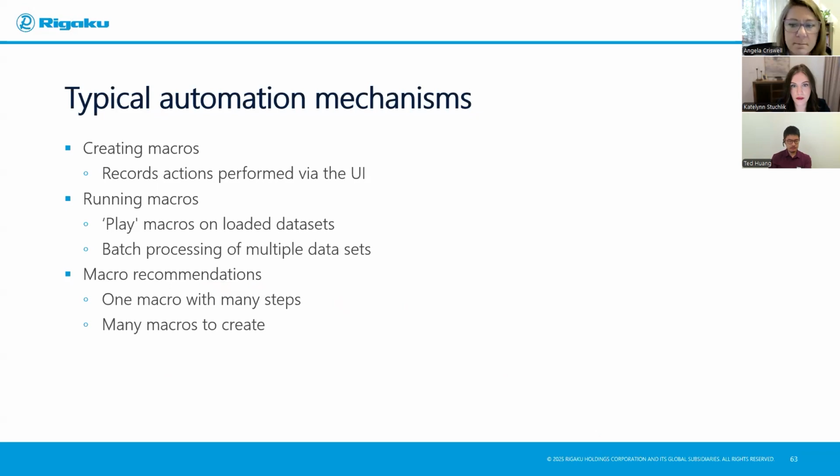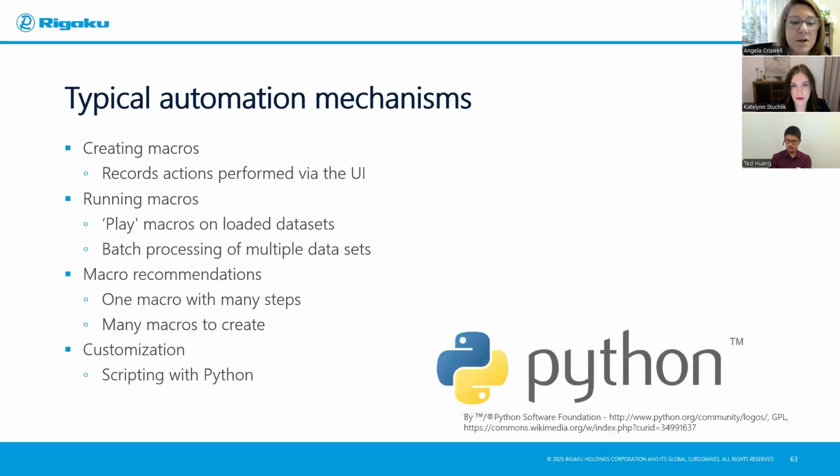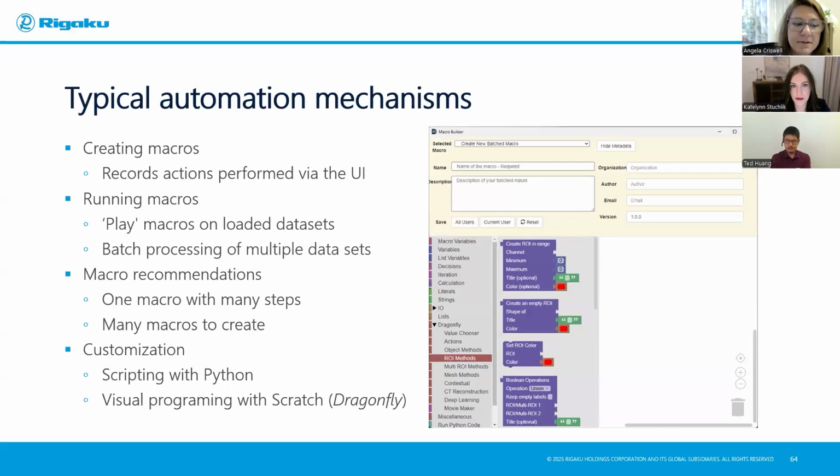And of course, there's always a mechanism to customize these. So if you already know programming with Python, then you're in great shape because these use an underlying Python programming language to do this. And additionally, specific for Dragonfly, they do have some visual programming using Scratch. So if you're familiar with that program that was developed by MIT, then you can build up your building blocks, or once you create a macro, then you can modify it inside this visual programming environment.